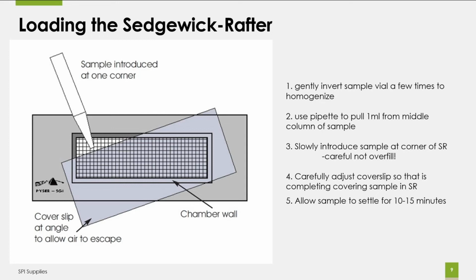So like I said, you just want to fill it up, which again, I can walk you through how to do in a demonstration. And then you want to let it settle for about 10 to 15 minutes, because after you've homogenized it, everything's free floating in that slide. If you start counting right away, you're going to see things drifting. So you just want to wait till everything settles.